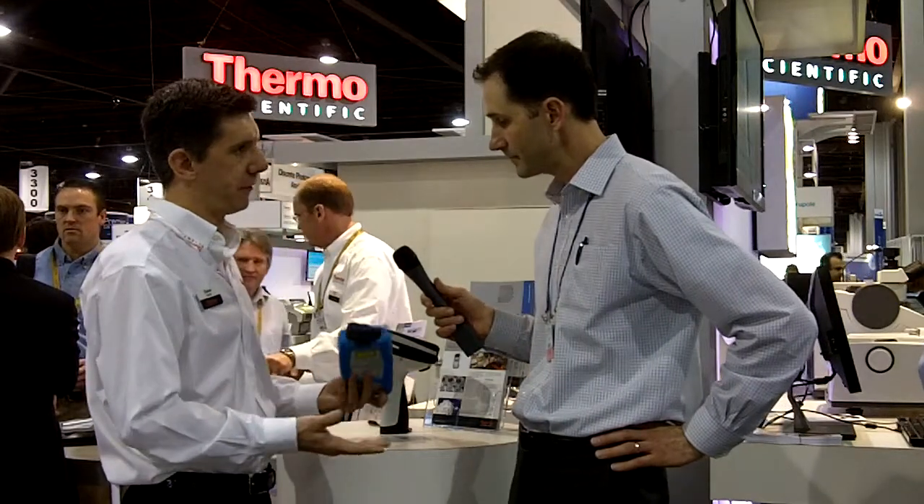In 2007 we introduced TruScan, the world's first GMP-certified portable Raman. The whole intention was to reduce contamination in inspection and make it a lot more efficient by having a handheld. What we've introduced — announced publicly two weeks ago, and this is the first public showcasing — is the TruScan RM, which stands for Raman. Taking the concept further: it's half the size, half the weight, and a typical sample takes five to ten times faster than the first generation, which was already magnitudes faster.